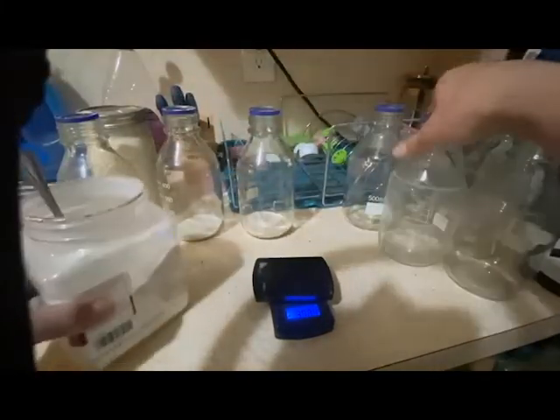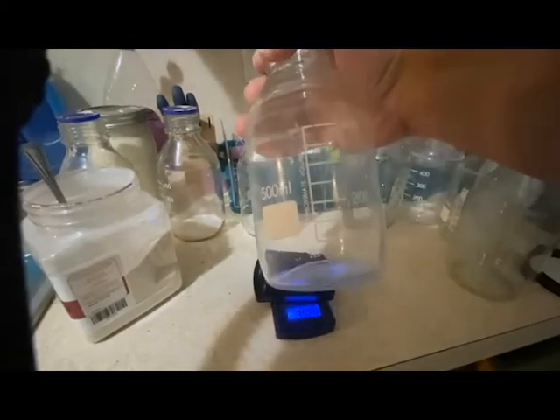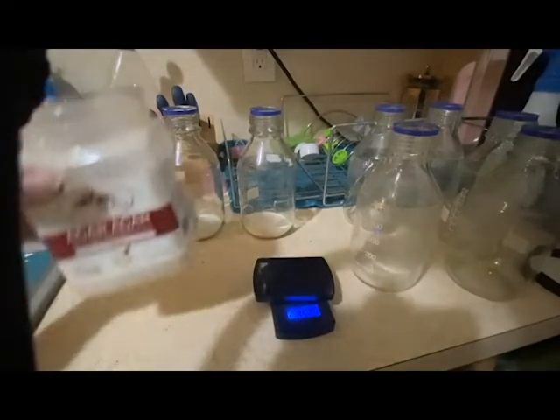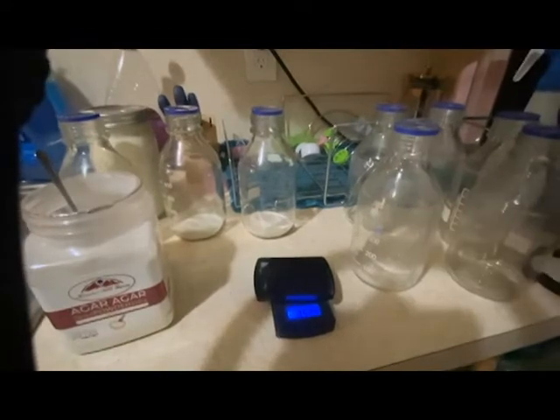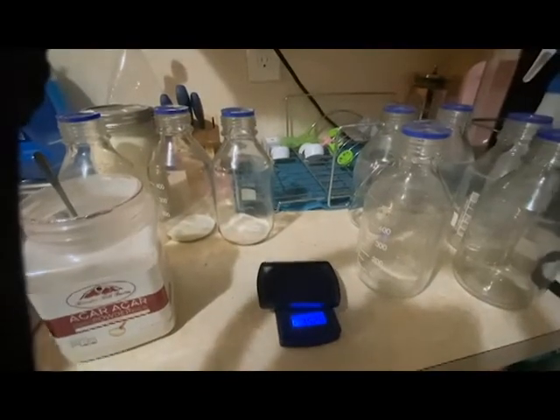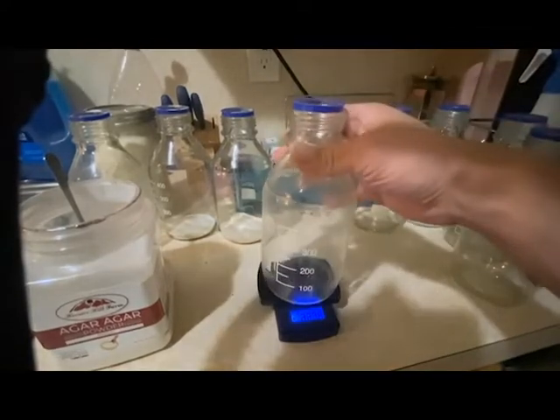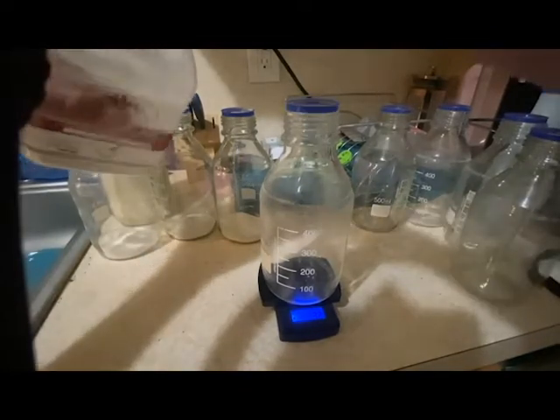So real quick, I got quite a few of these media bottles. They are 500 milliliters. I got a 4-pack off Amazon for like $25. For anybody that is wondering, I use this brand of agar. I think most brands are okay. I know a lot of people have great things to say about Telephone brand agar, but at like $20 for a pound, can't really beat that. Is it really necessary to spend like $8 or whatever for a 4-ounce pack? Like, nah, I don't think so.